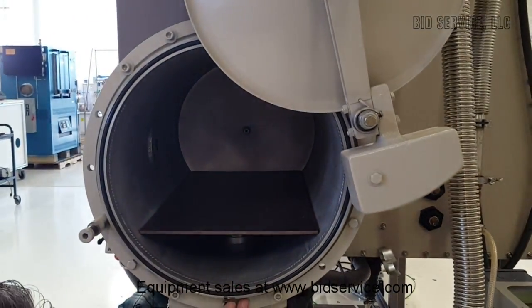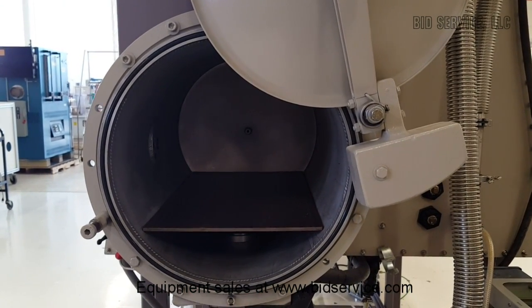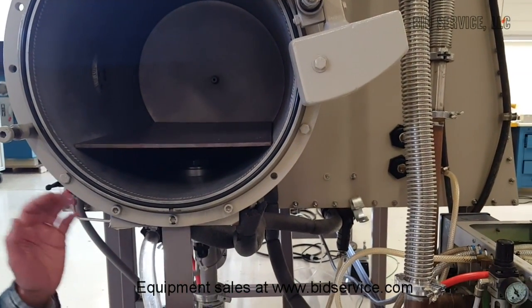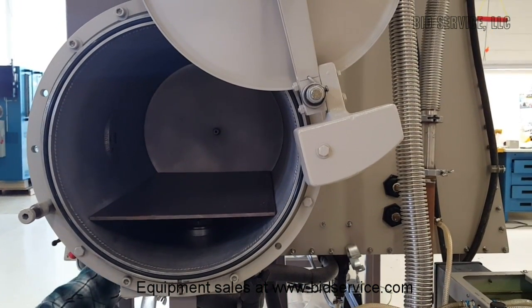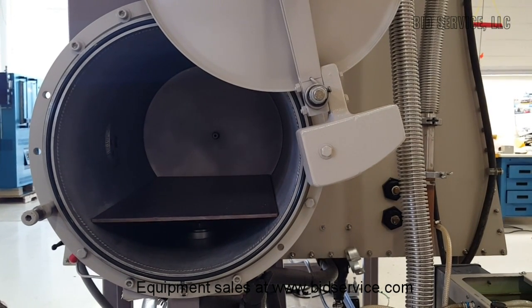Coming out of that, we connect it here — there are cooling coils on either side of the doors for your vacuum oven to keep the seal cool. You have one on the outside and inside, then it's sent to the other side where there are identical copper cooling lines on either side of the doors, then returned back to your chiller.